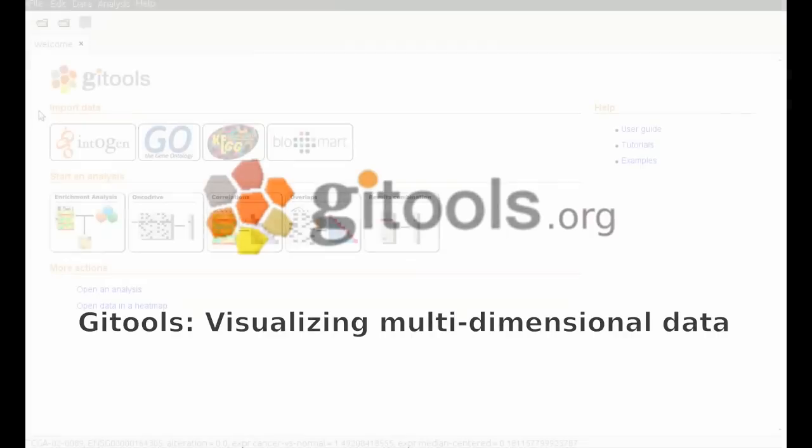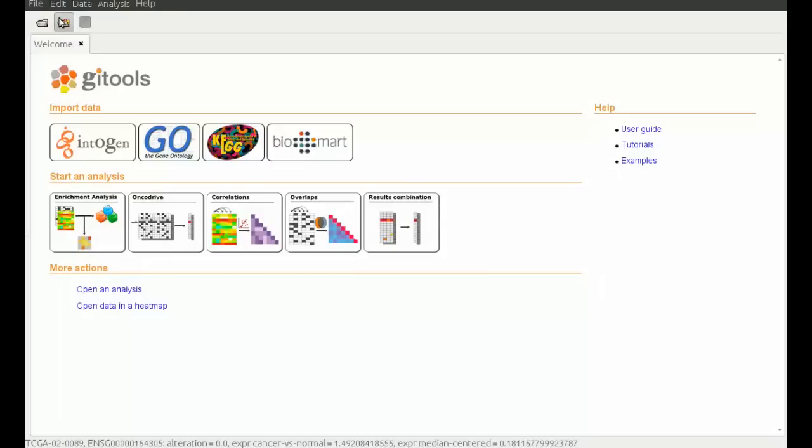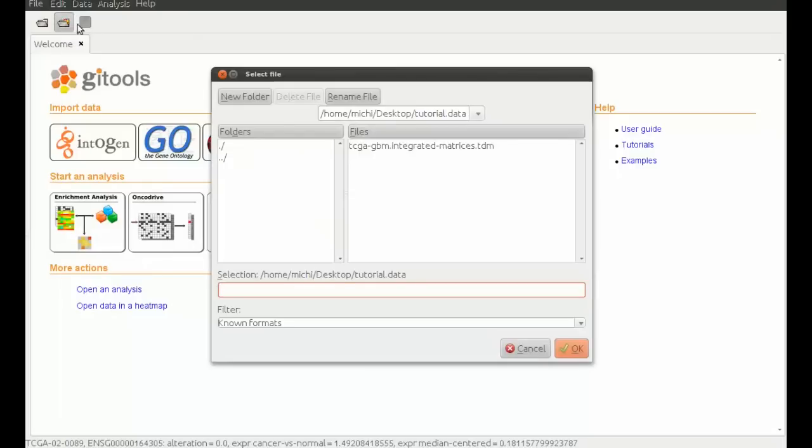Here we have an open instance of Gitools. We will select the icon for opening a heatmap from a file. As you can see, the multivalued matrix has the extension TDM.